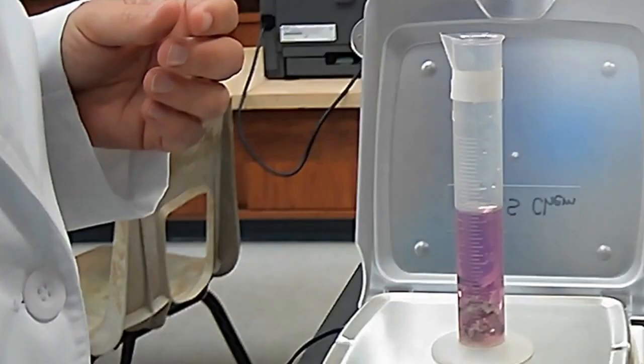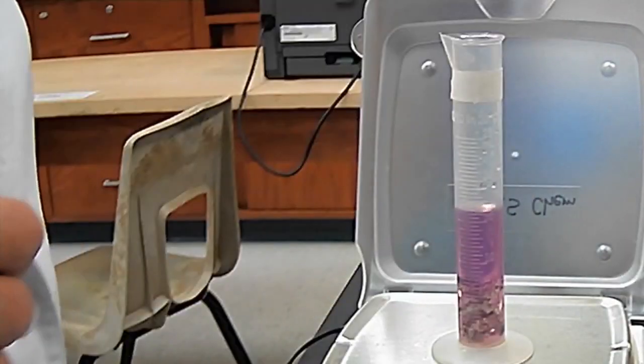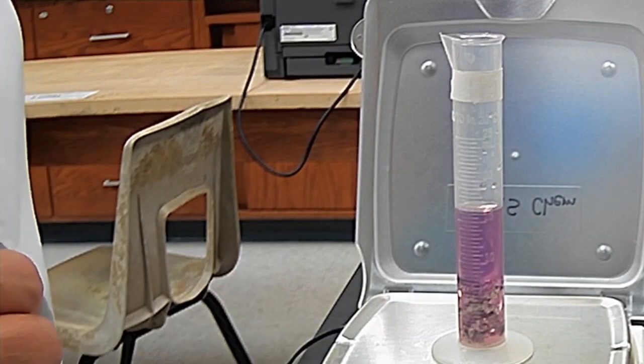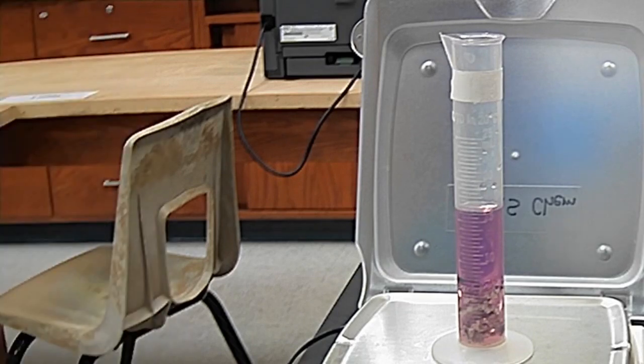Okay. We need 3 trials. All right. So now our new mass is 30.3 grams.